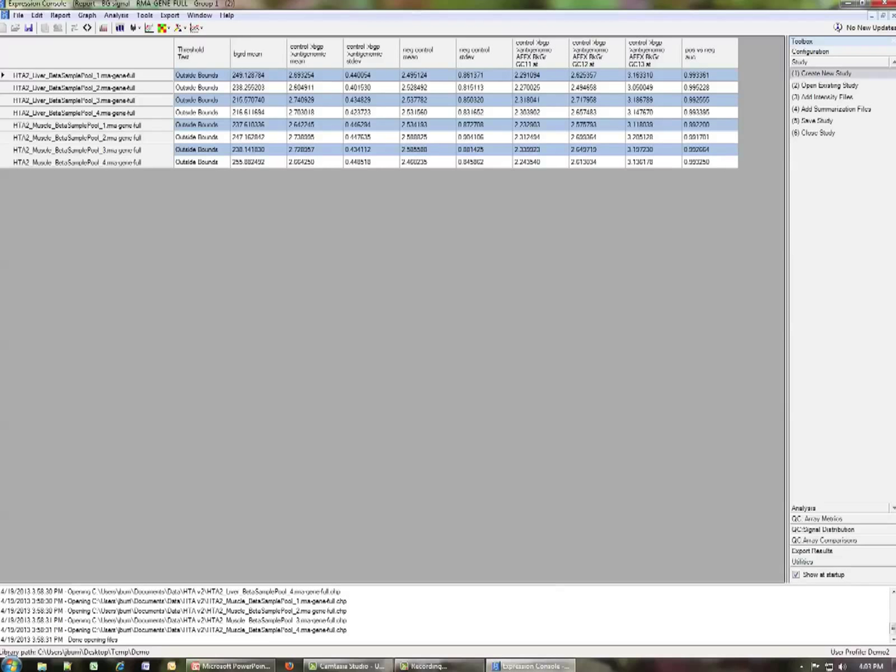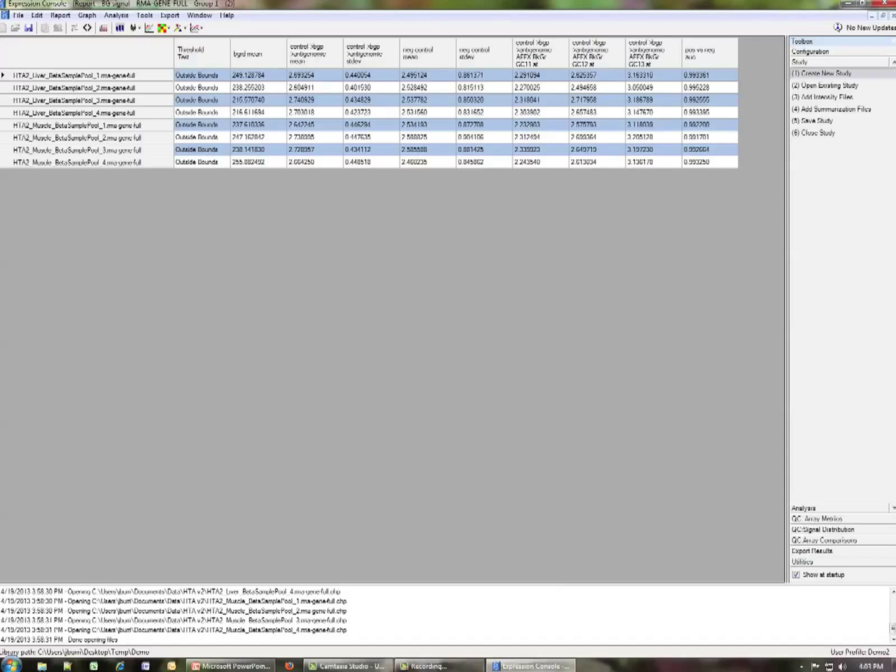And you can see now we just have a list of all of the controls related to the background signal. Here's the background mean. That is in linear space. The other ones are in log space. And you can see these are after normalization. And you can see here's the background mean. And you can see, in fact, that we've changed the order so that the positive negative AUC is at the end.